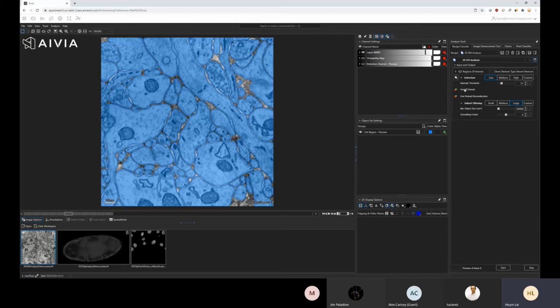The next option is to use a 2D or 3D kernel. Depending on the type of analysis that you're doing, if you use the 2D kernels, this will apply the UNet based on just the 2D image. So it'll take specific sections of the image in 2D. Whereas for 3D, in addition to each slice, it will also take into account the slice above and below that as well.